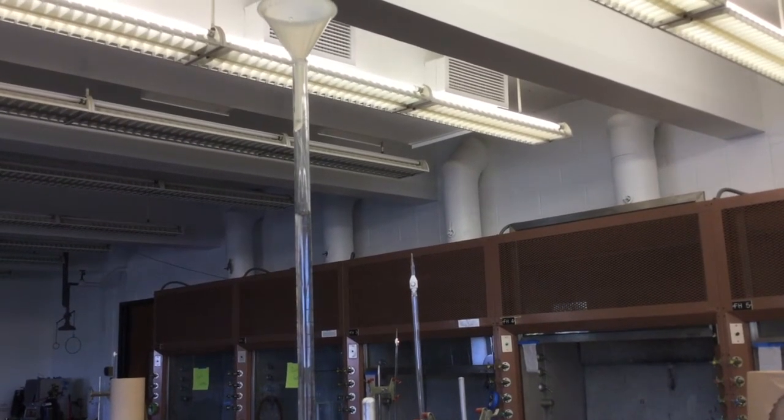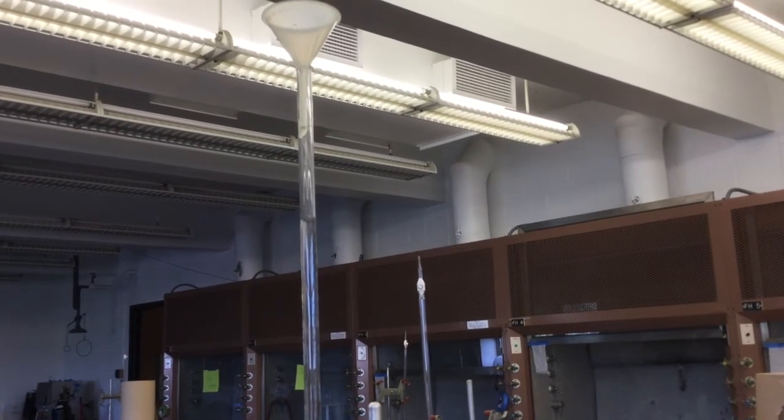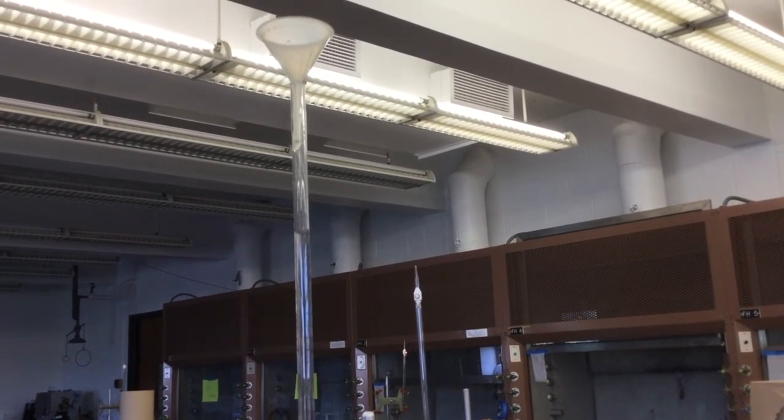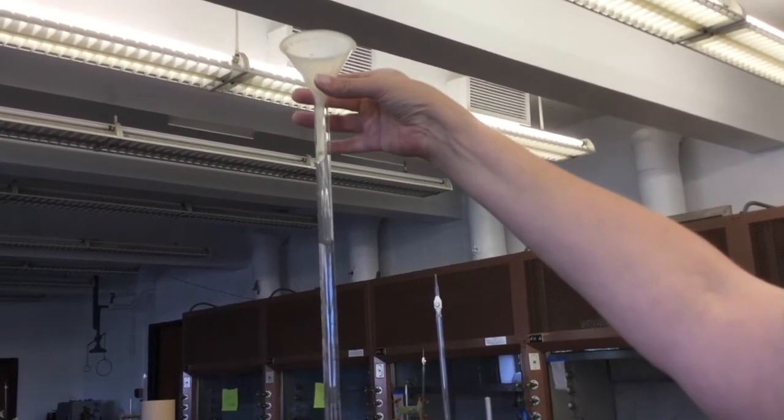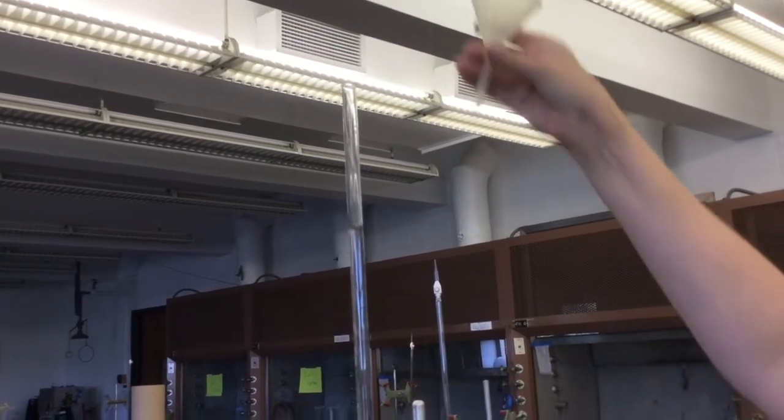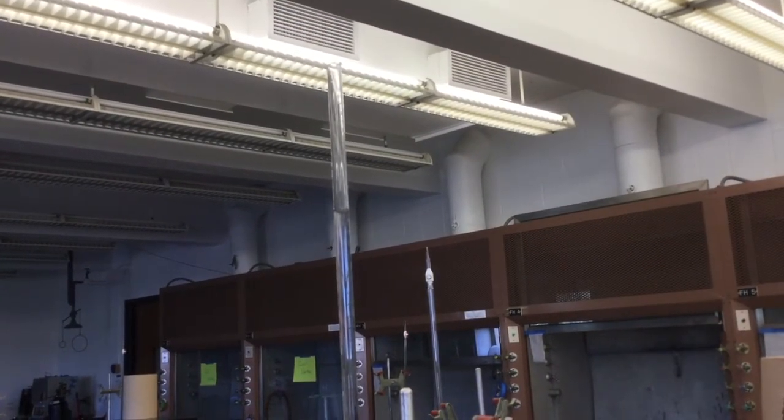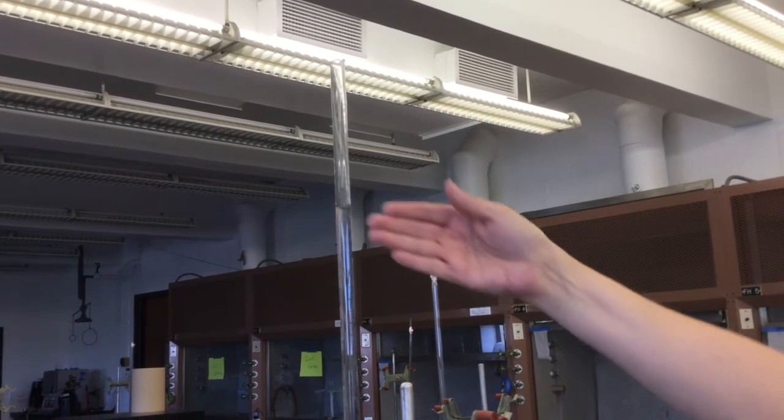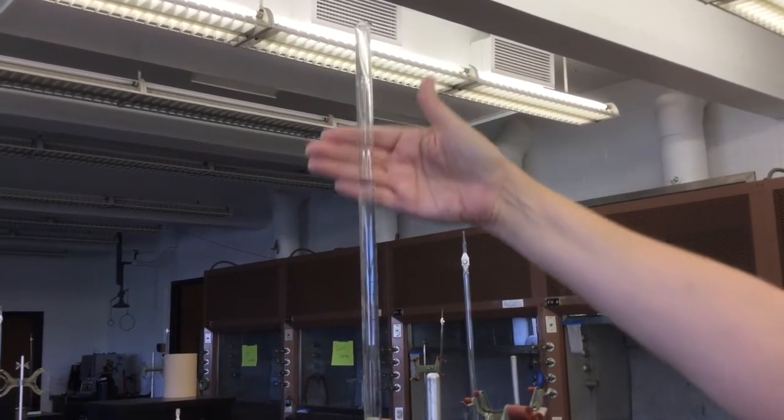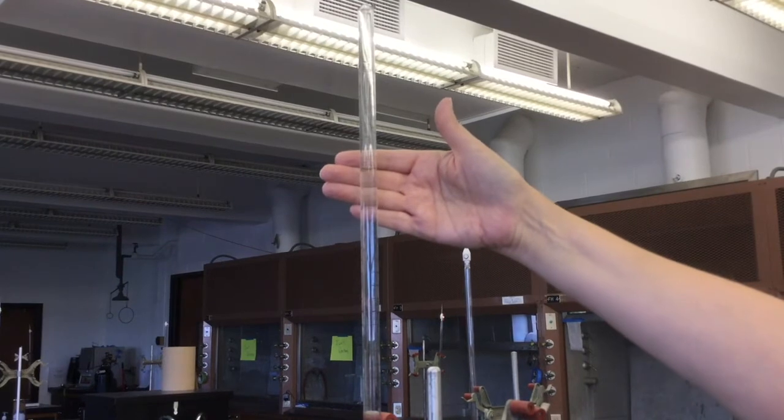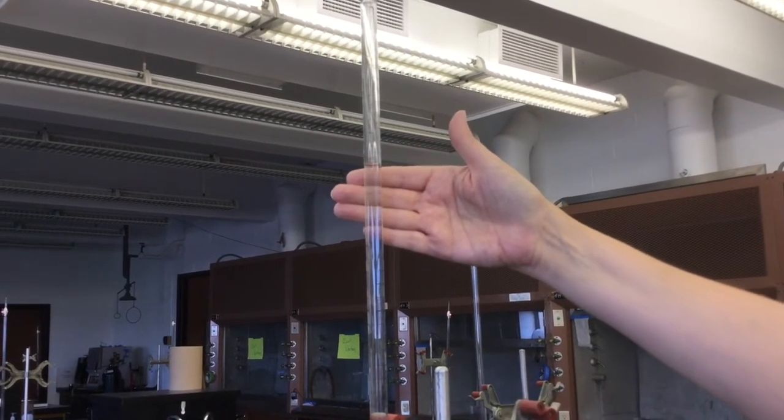Before you begin, you're going to need to fill your burette. Once you have filled it with the funnel, you need to remove the funnel from the top so that you don't have continuing liquid dripping down and changing your volume. Make sure that your volume is between 0 and 10 milliliters so that you have plenty of liquid to use for your titration.